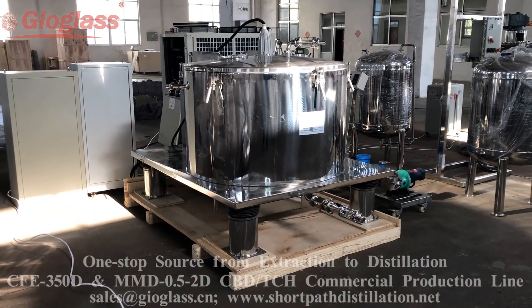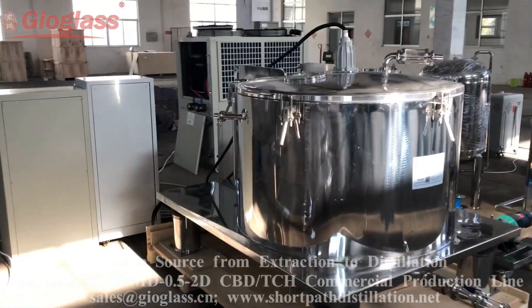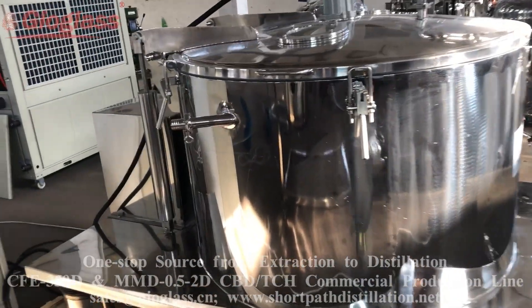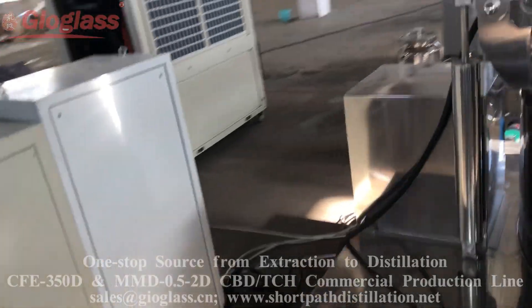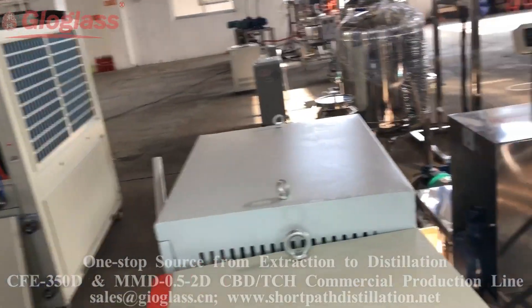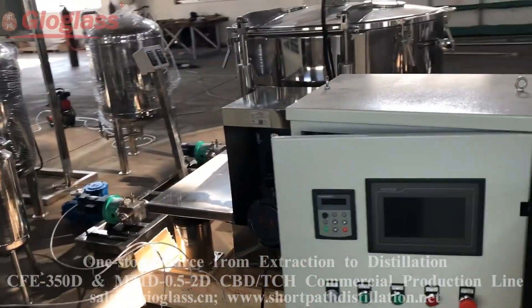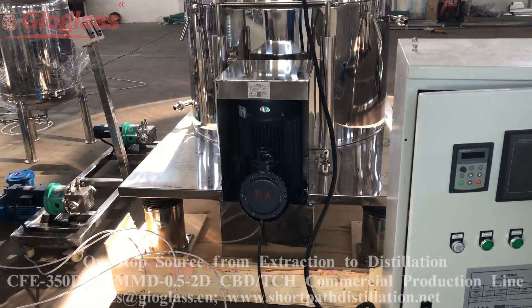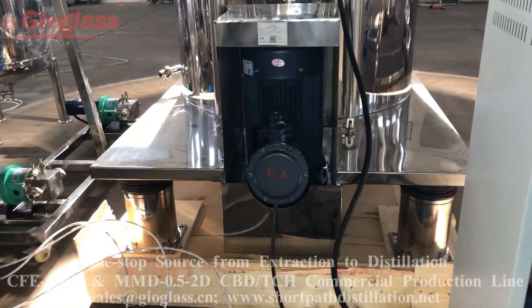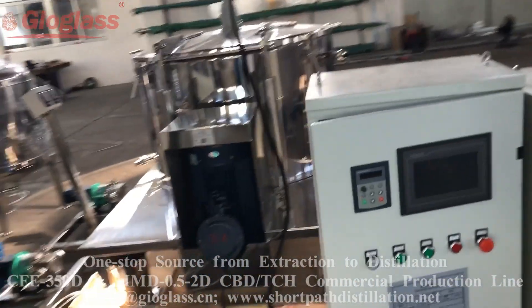This is the centrifuge extraction machine. The temperature is minus 40 to 50 degrees centigrade. This is the explosion-proof design — you can see the motor here. This is the control cabinet.